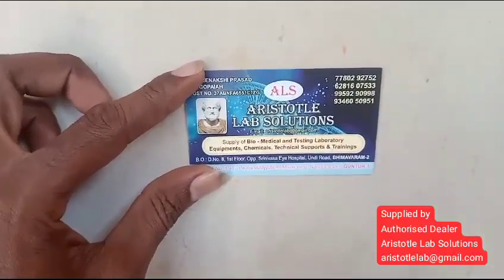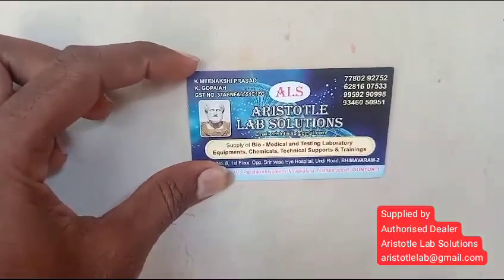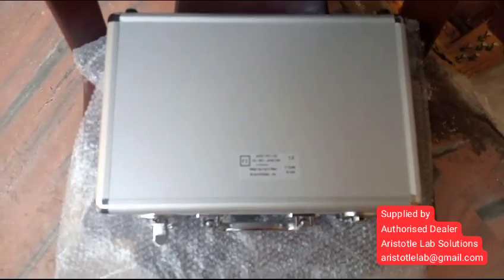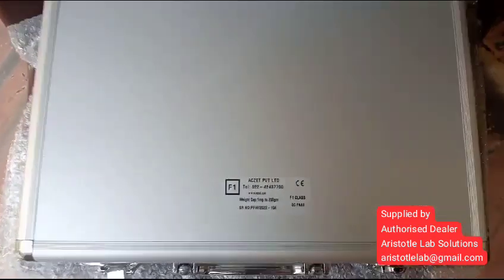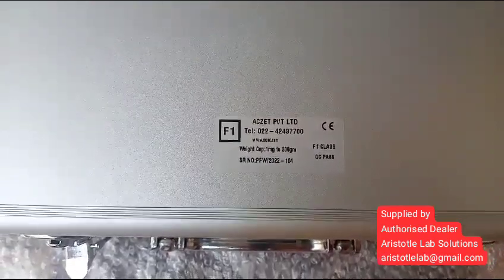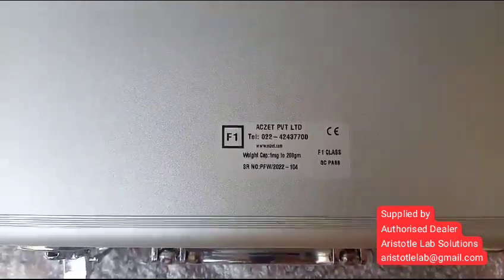Hi viewers, welcome to Aristatil Lab Solutions. This is the weighing box — it's Set Private Limited. It's 1mg to 200 grams in F1 class.